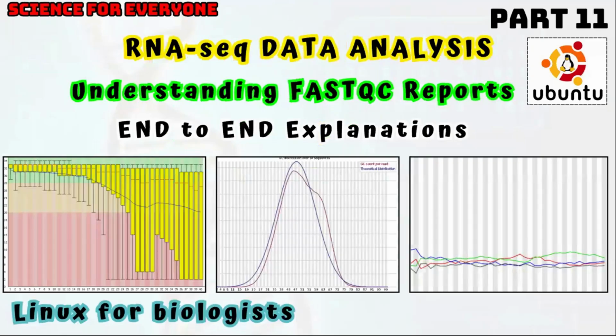In the previous video, I discussed the FastQC report. If you're not familiar with the FastQC report, it is very important, because part 11 of this video series is basically a preliminary of part 12. If you understand the FastQC reports, then you can easily perform Fastp, because in Fastp you have to select the appropriate flags that would pre-process your data effectively and correctly.